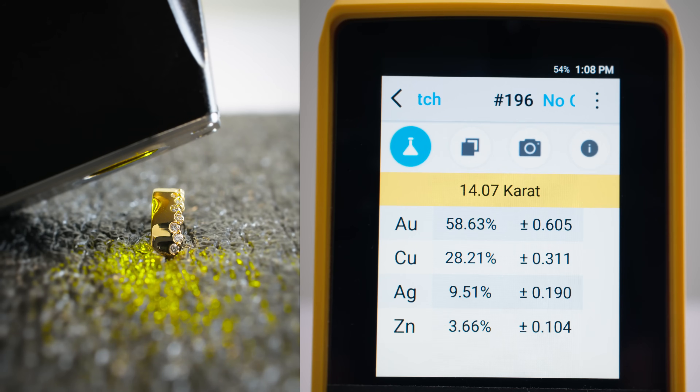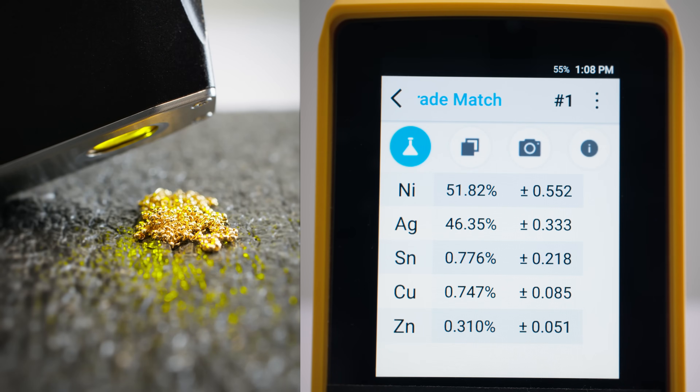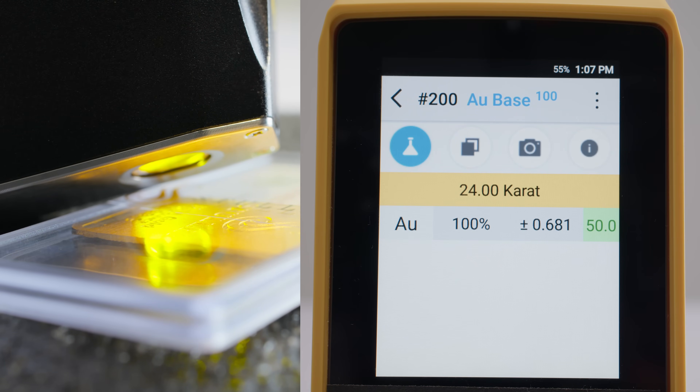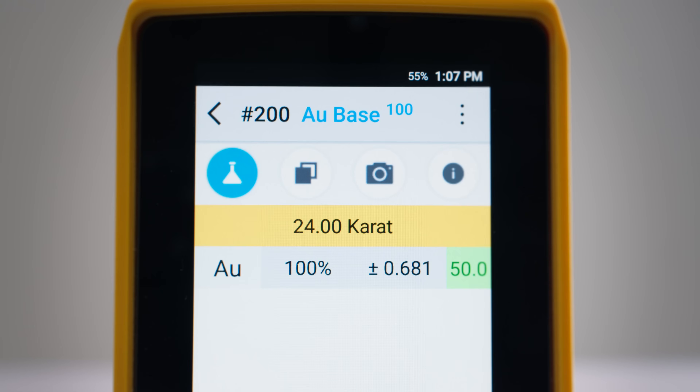Here is a 14-karat gold ring, a platinum necklace, a gold-plated chain, and even a gold bar — I kept this one in the case since the analyzer can read through plastic or acrylic coin capsules. When your item has enough gold content, the gold carat purity bar is automatically front and center.